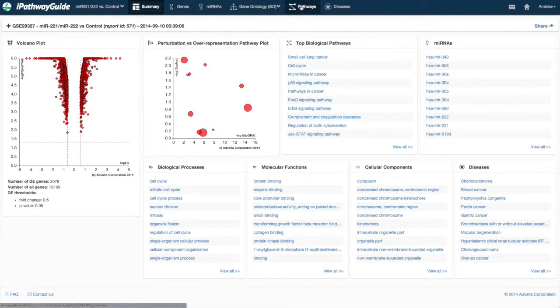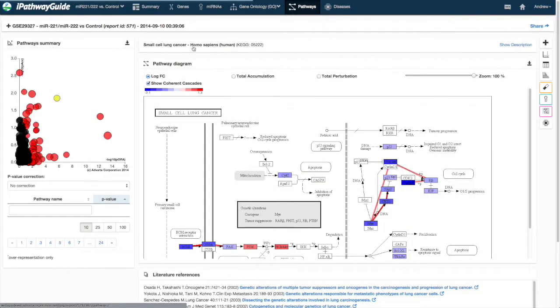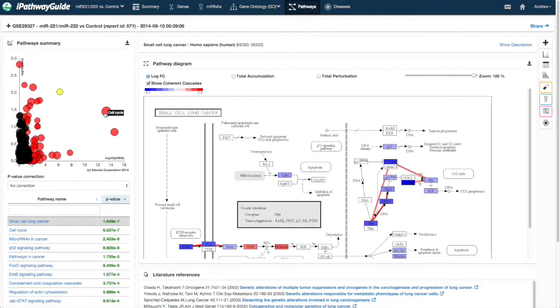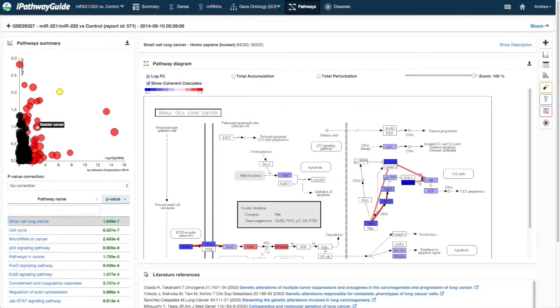In the Pathways Summary Plot, or Evidence Plot, each pathway is represented with a bubble. The size of each bubble corresponds to the size of the pathway in terms of the number of genes it contains.